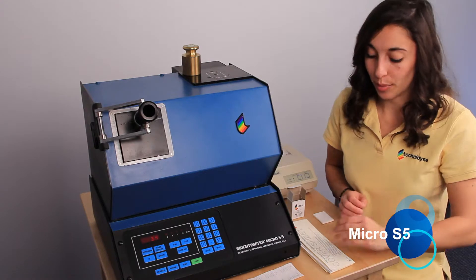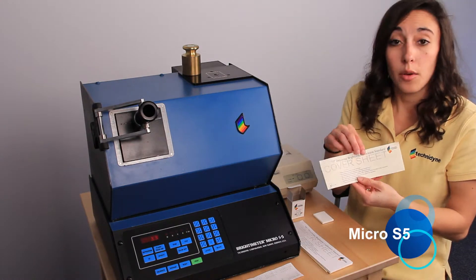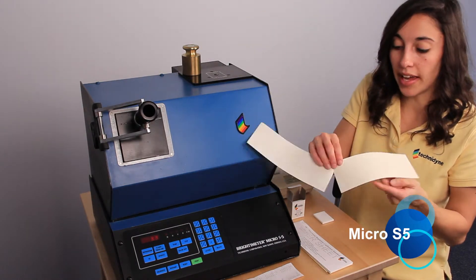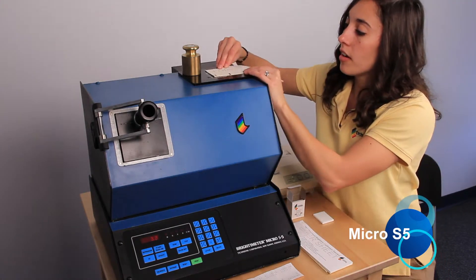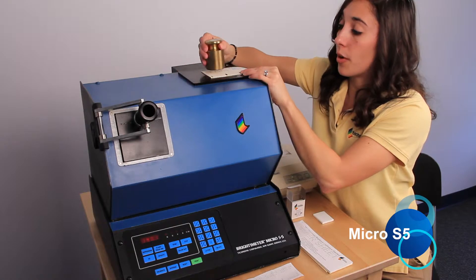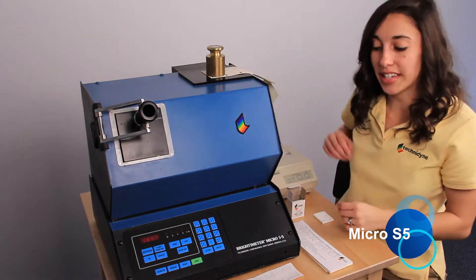Next, it's going to ask us to load our primary standard. We can go ahead and move this sheet back, and we'll load it so that the dash marks on either side of the one are lined up with the white lines. We'll load our one kilogram weight and we'll press scan.